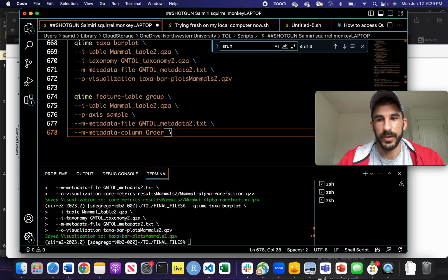order, I'm going to imagine, because class is mammalia, right? In this case, I believe birds is already class as well, so that you can use order. Reptilia, you can use order. And fish, you can use order as well. So yeah, order should work for all of your tables. If it doesn't, you may pick class or go down to family. It just depends. You might have to make a couple of these before you figure out the right one.